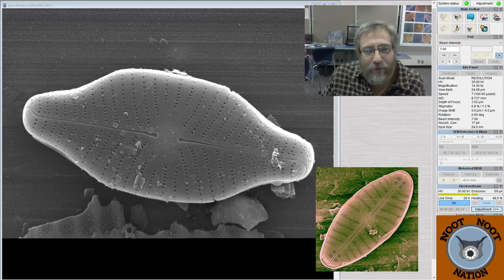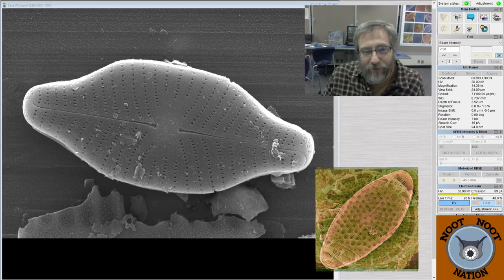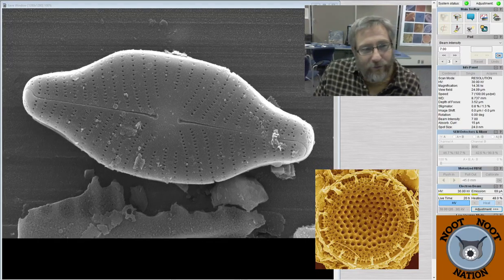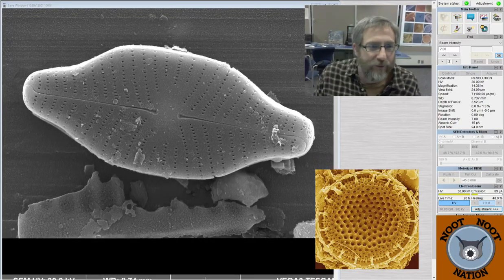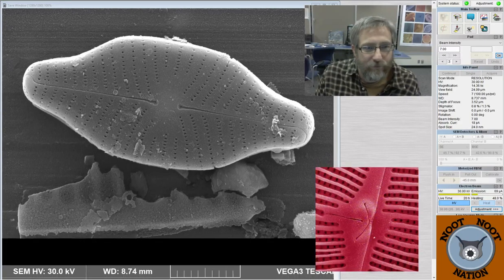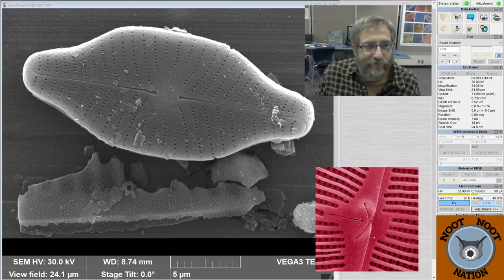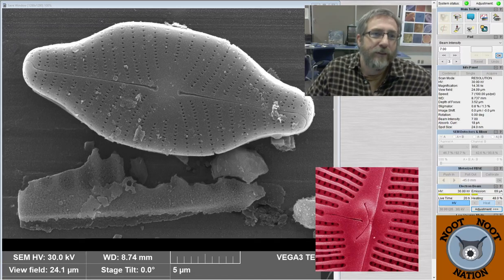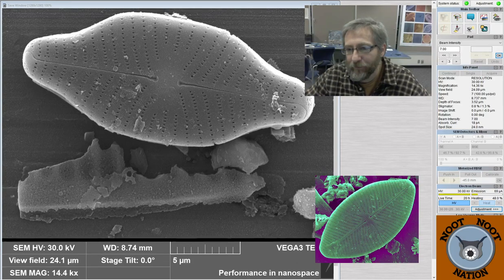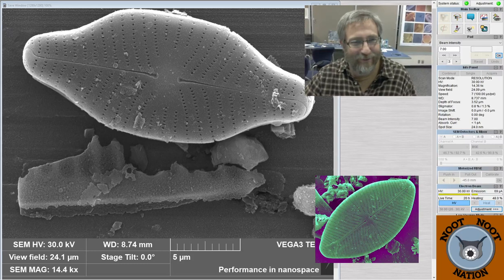If only we had somebody who would look into the genus for us. You know? Really seriously look at it. That's where I would stick it, though. Like, if somebody asked me, where do you think this goes? I would start with Salophora. I suppose it's a good one to get an SEM image of, because I don't know what it looks like in the light microscope. Is it a challenge? Yeah, it is a challenge. Figure it out for us.